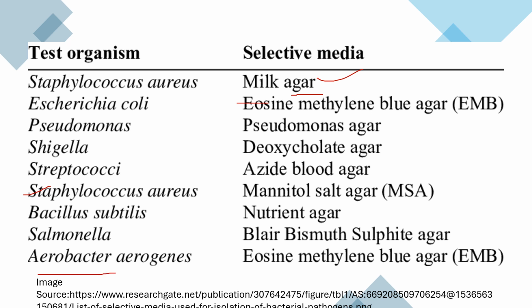Okay, so if your microorganism belongs to this particular group, you have to have some selective agar while plating them or while growing them.